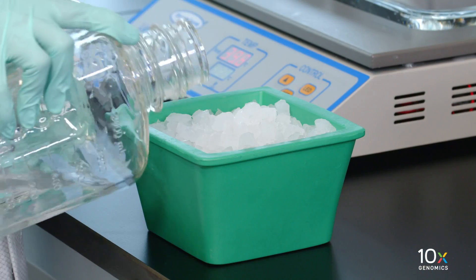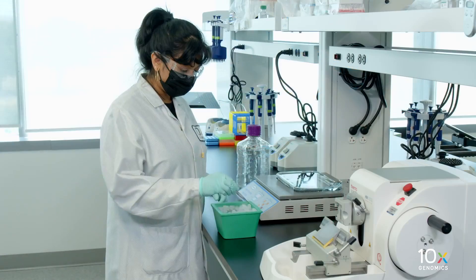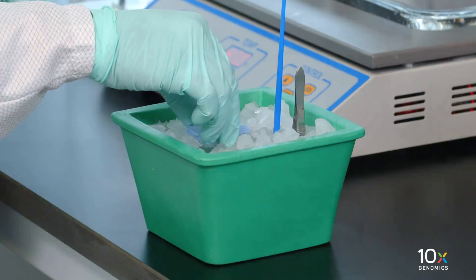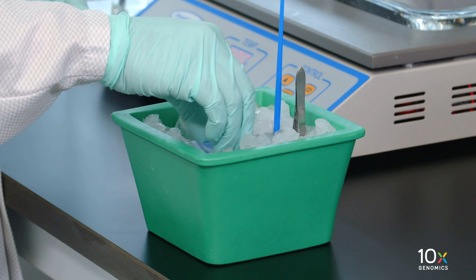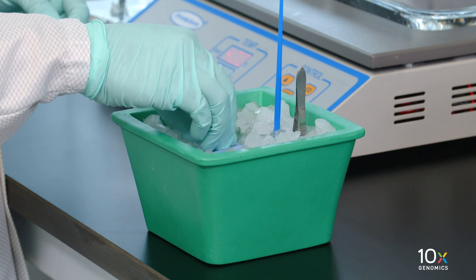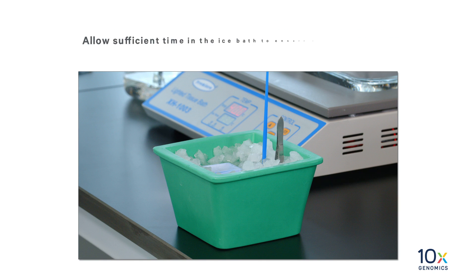Next, we will prepare an ice bath. Fill an insulated ice bucket with ice and water. Place sectioning probes, brushes, or forceps in the ice bath. For sectioning at 5 microns, place the tissue blocks in the ice bath and ensure that the tissue part is fully submerged. Incubate on the ice bath for 10 to 30 minutes. The incubation time depends on the tissue type and extent of dehydration, which depends on the processing method and the age of the tissue block. Allow sufficient time in the ice bath to ensure proper hydration.